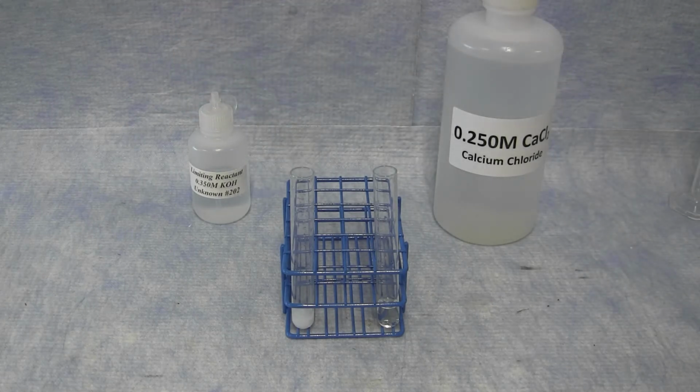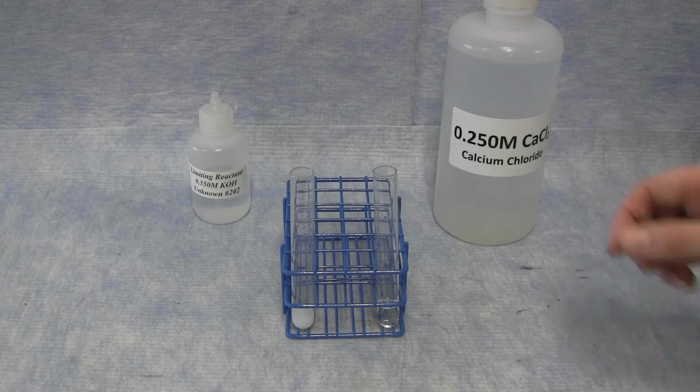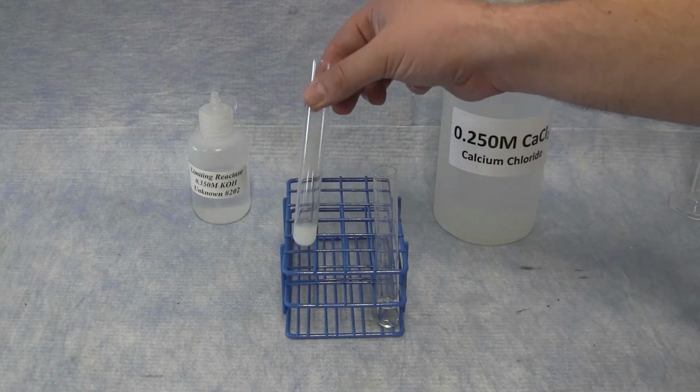Using that theoretical yield, you can also determine, based on the solubility of calcium hydroxide, what is the actual mass of the powdered material in the bottom of the test tube.